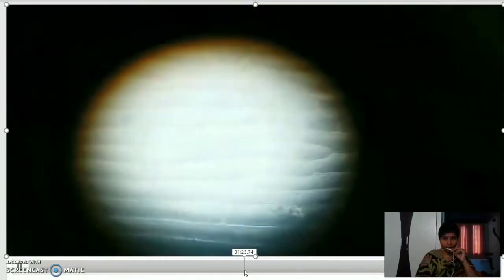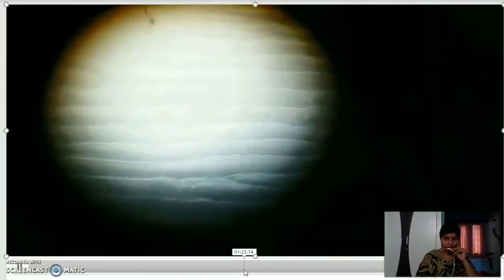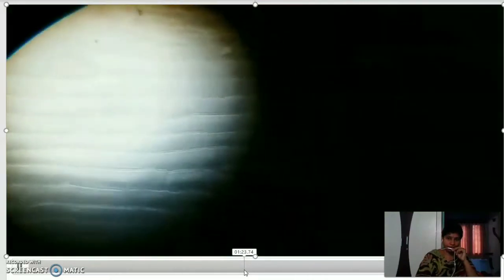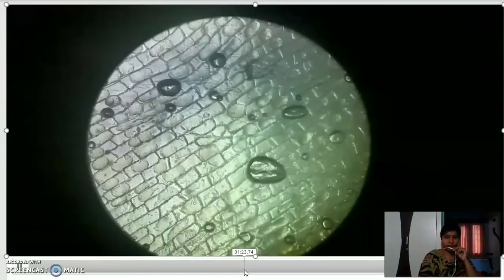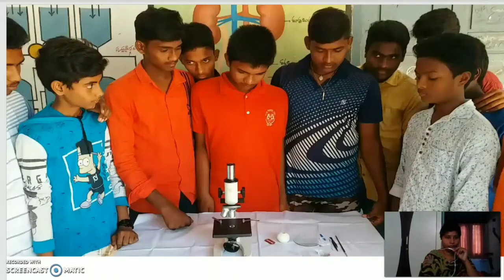Remove the excess water from the slide with the help of paper or blotting paper, and observe it under the microscope. You will see brick-like structures with thick walls — these are the cells of the onion. It is very clear in this picture. Keep in mind the structure of the onion peel cells — these are the cells present in plants.